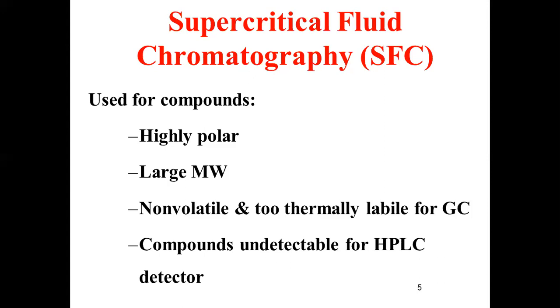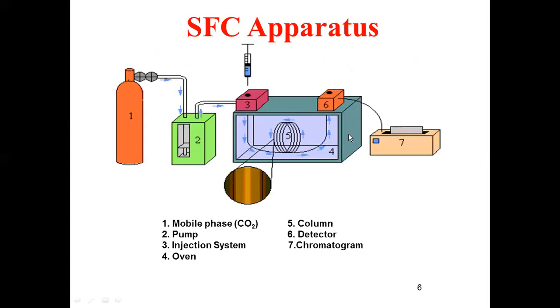So the supercritical fluid chromatography technique is designed in such a way that all those compounds which are excluded from separation by gas chromatography and high performance liquid chromatography can be easily subjected to separation by supercritical fluid chromatography. Here you can see the instrumental aspect, the schematic of the instrument which will be used for the separation of the compounds in supercritical fluid chromatography.